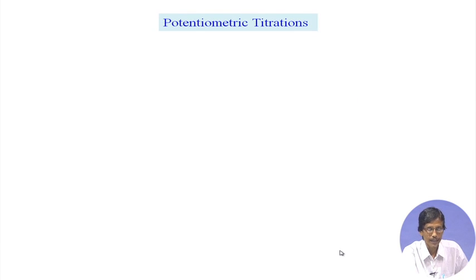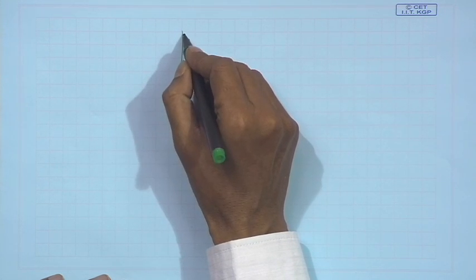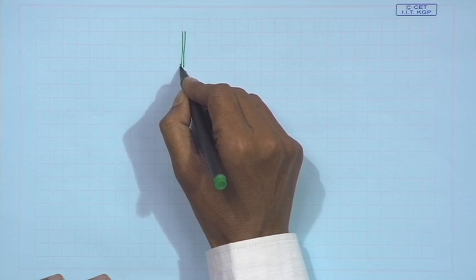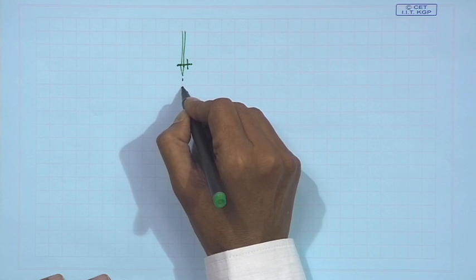So, how do you get to the potentiometric titration now? We will reach that point through the development of all these electrodes, their designing and their positioning. Like your simple titration, you utilize the same burette, which we know adds the solution drop by drop to the container for your titration.